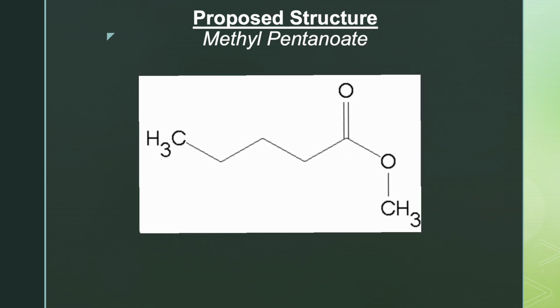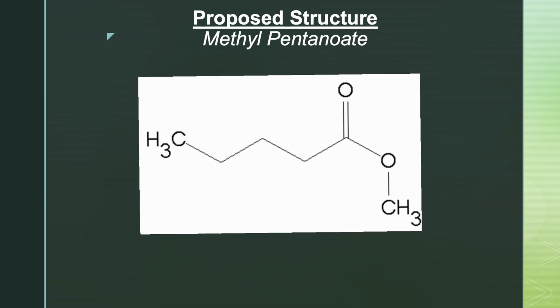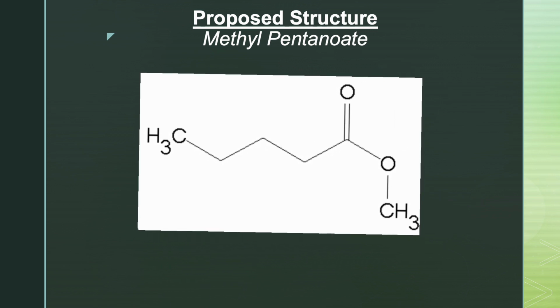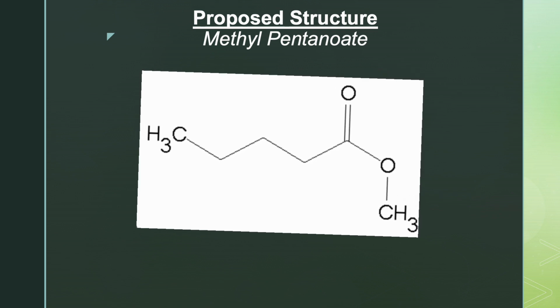The other thing that made me go with this structure were the 6 unique carbons. So when we look at the symmetry on here, we know that each carbon is different. There's not going to be 2 that are similar.